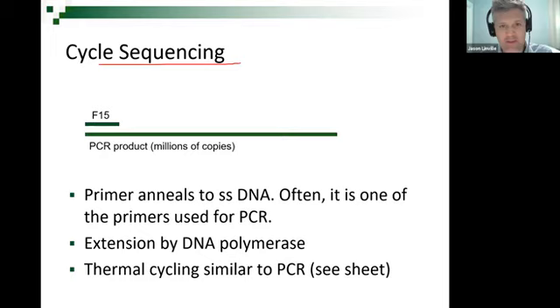What did we do with it? We mixed it with formamide and size standard and loaded it on the instrument, and then recorded our 13 pairs of numbers in that long, boring video last week.